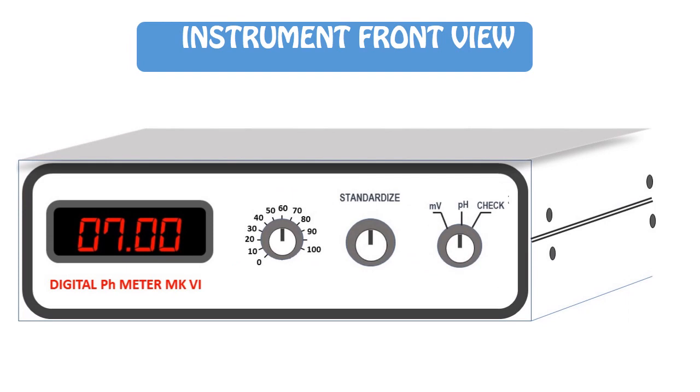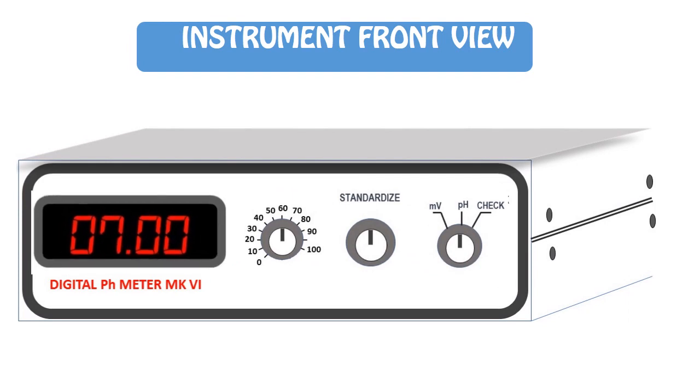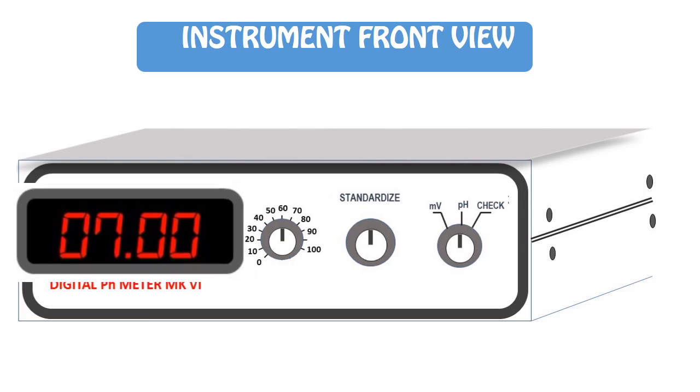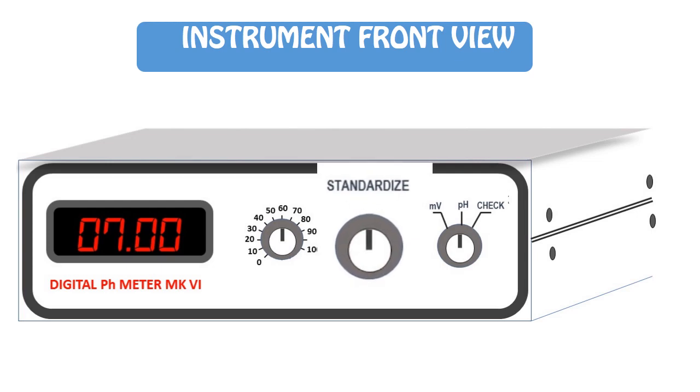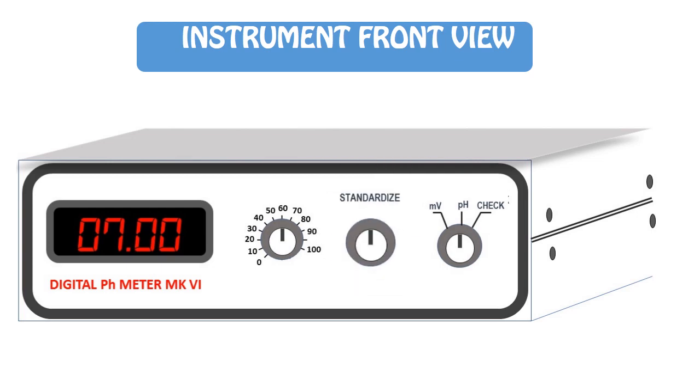Here we can see the front view of the instrument. It features a display, a temperature setting knob, a standardize knob, and a pH/bar millivolt selection knob.